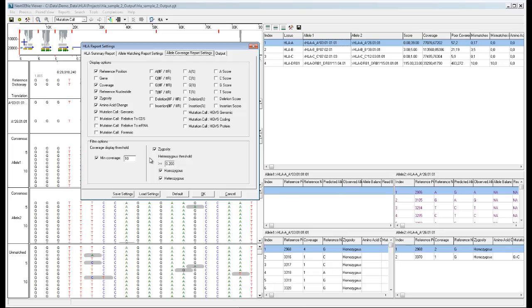You can also filter based on the zygosity of the position, and can set the threshold for a position to be considered as heterozygous.